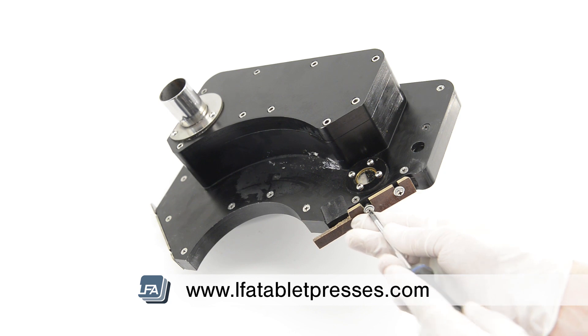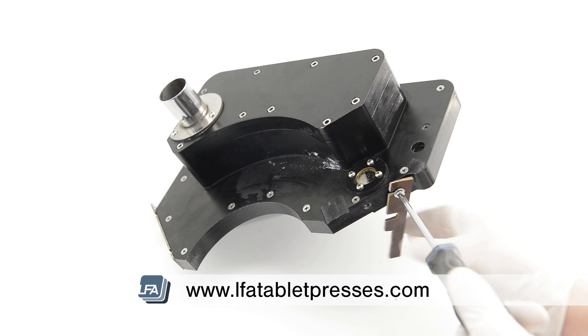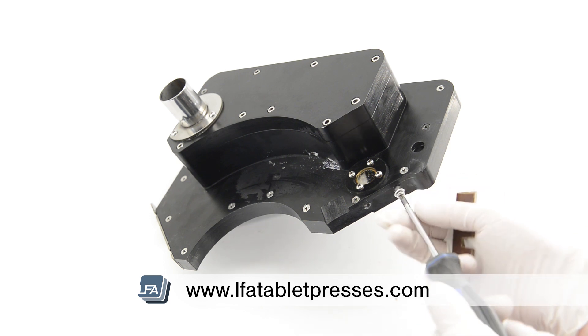Next we're going to replace the force feeder, but before we do, remove both the scraper blade and tablet takeoff blade with a crosshead screwdriver, as these need to be replaced with the force feeder in position.